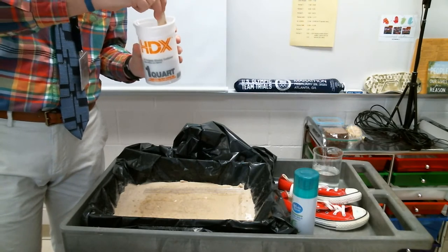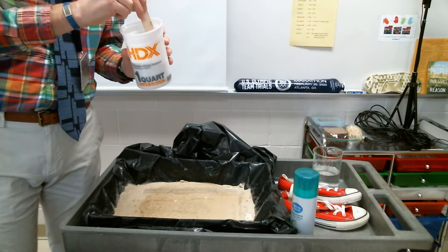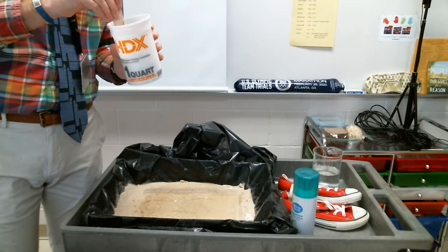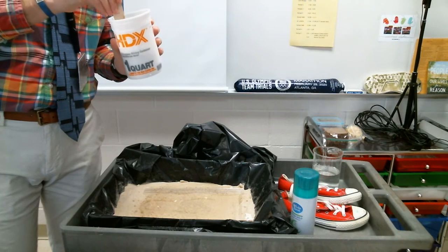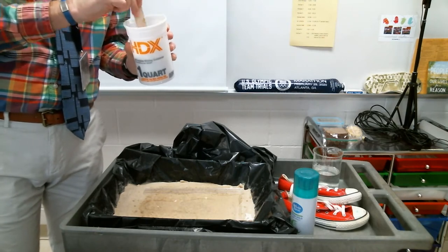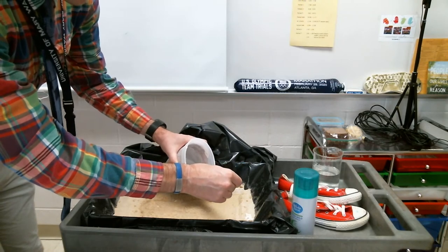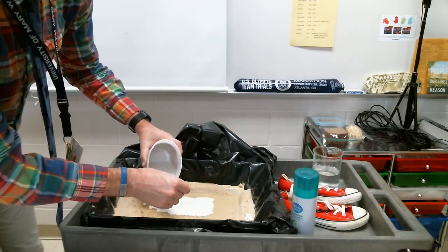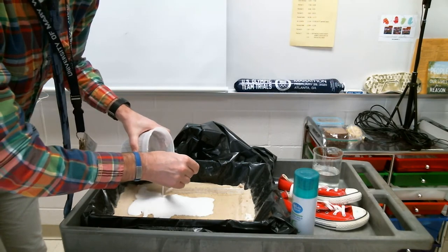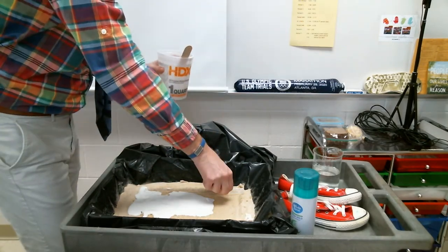I'm about ready to pour this on here. When I pour this on there, I want to be really gentle — I kind of want to pour it onto this little stir stick I have. Why do you think I want to be careful with the plaster as I pour it on? If you said we want to make sure that we don't destroy anything, you would be correct. I'm going to try to cover everything on here — the whole impression and then around it as well — to make sure I get the full tread.